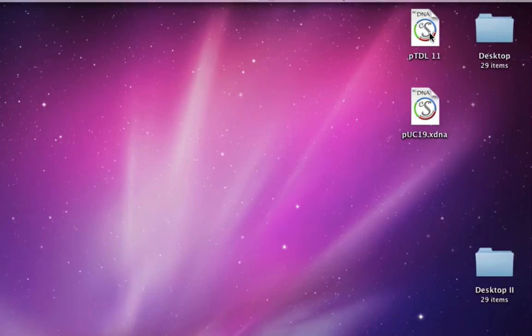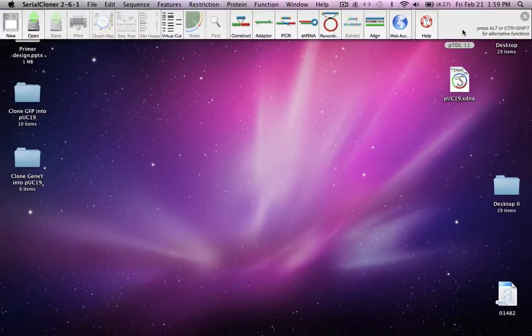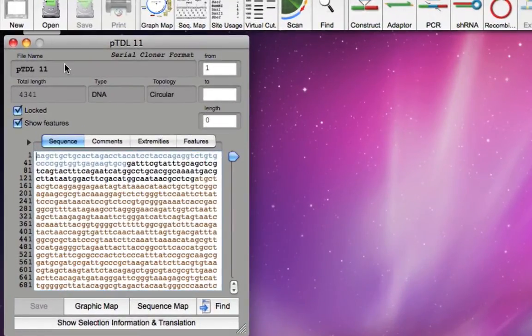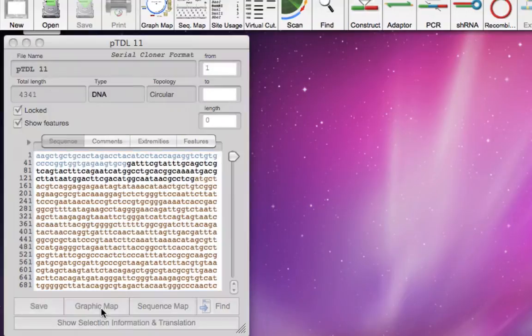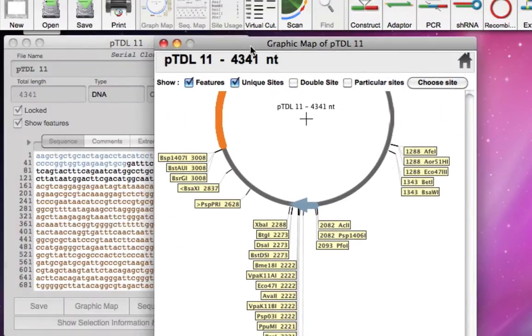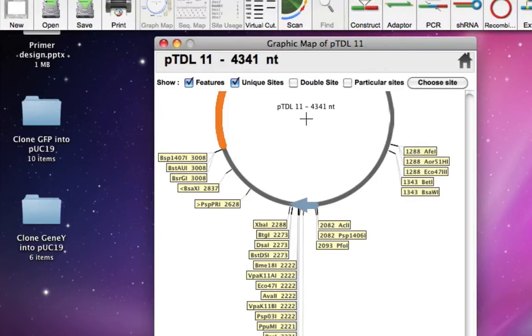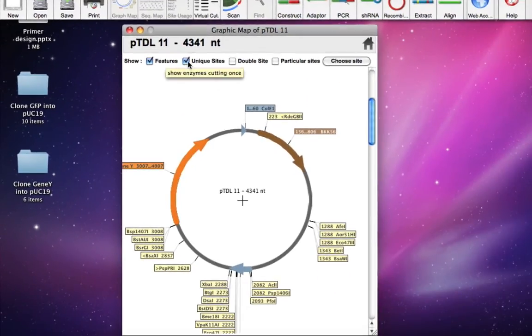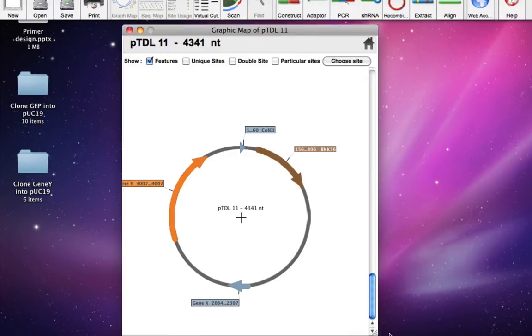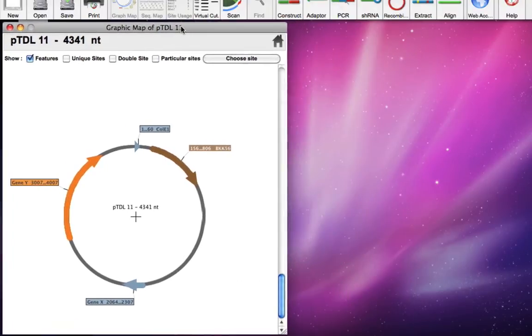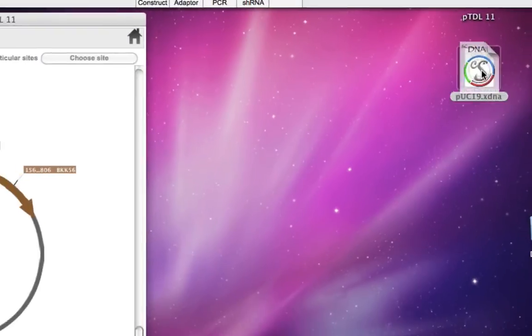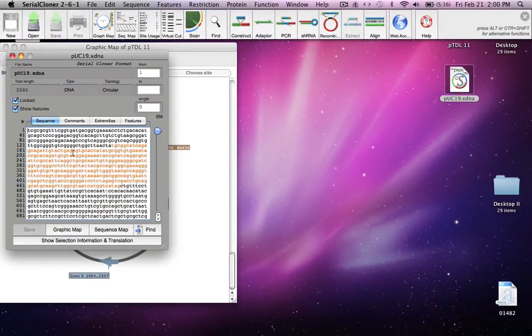Let me open plasmid TDL11. Here's the text pane. I'll click on the graphics map — the default setting shows all unique restriction enzyme sites, which makes it very busy. I'll remove the unique enzyme site display so it looks much cleaner. This is gene Y that we want to clone into PUC19. Now let's open the PUC19 plasmid.